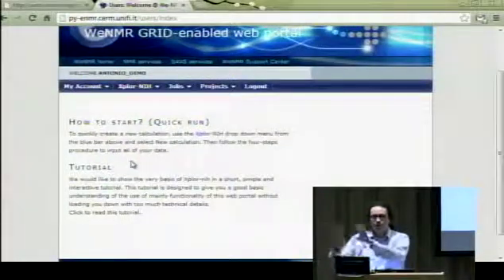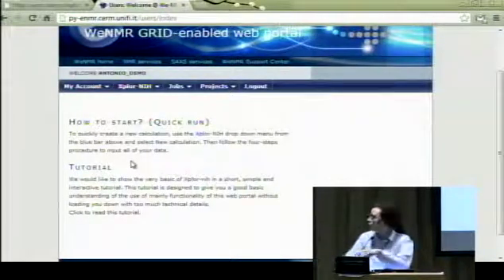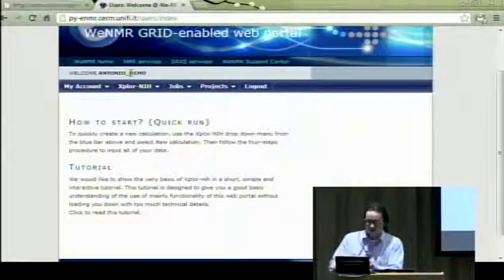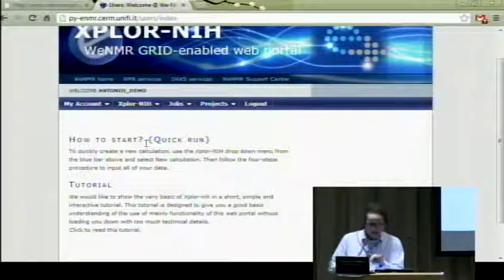It's the same portal, but we already skipped the login page. It's already in, and it's saying welcome and my name. This is just the demo thing, but that's valid for today, but at least you can see what I'm doing. And then you can download the data if you want to try.